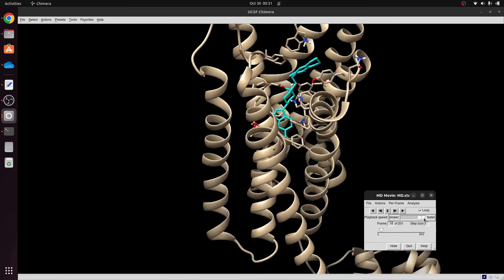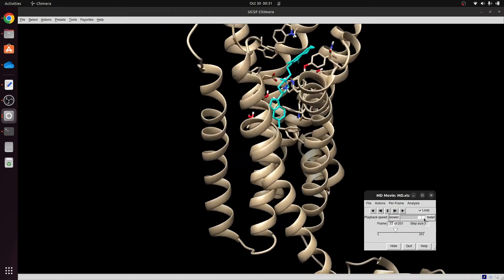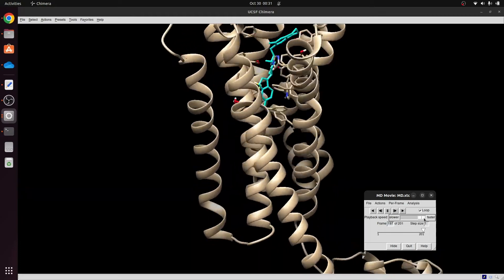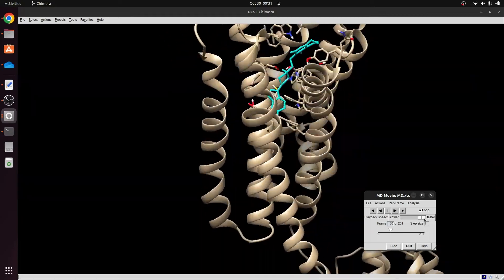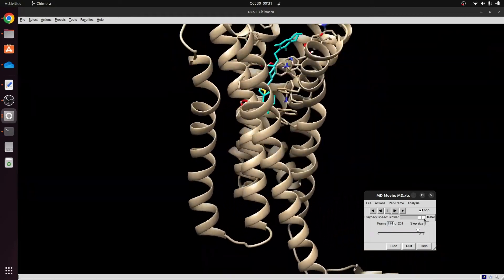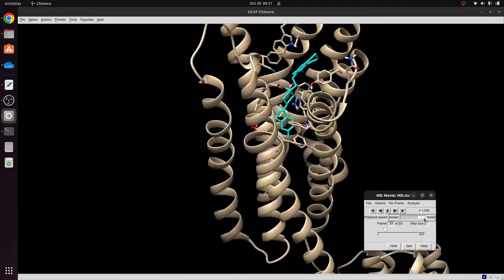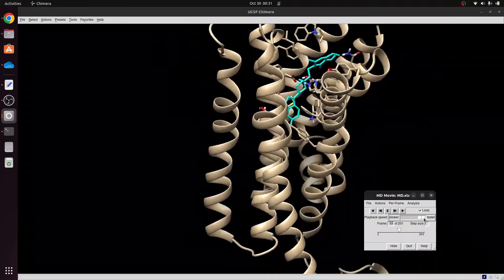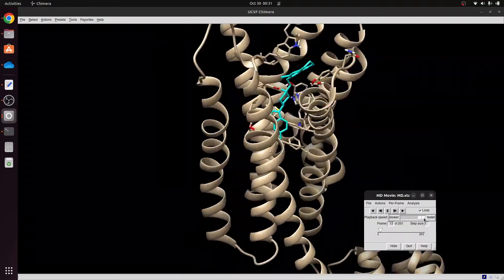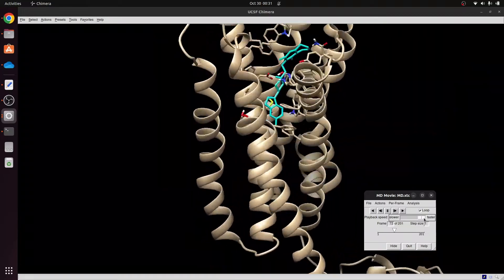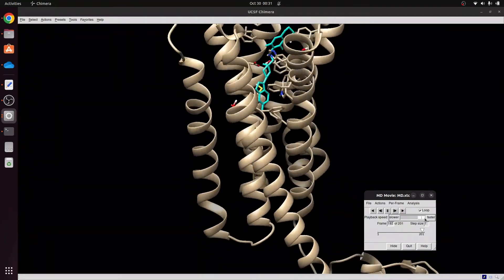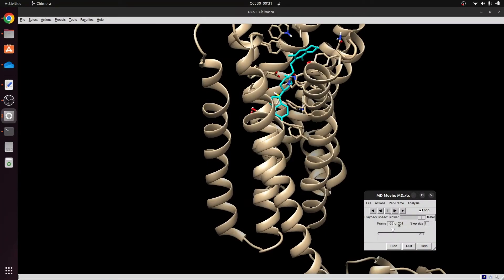I can also increase the speed to full speed. This is how the MD simulation looks at full speed — showing the vibrations of the protein and the ligand within a two-nanosecond MD run.